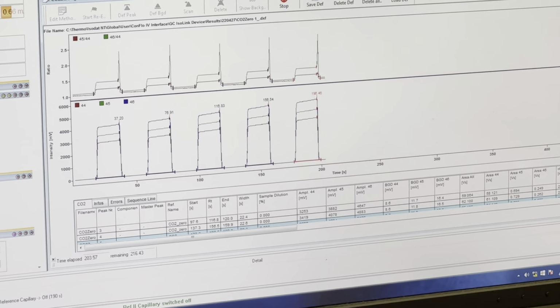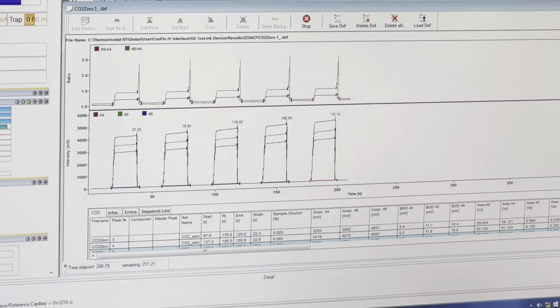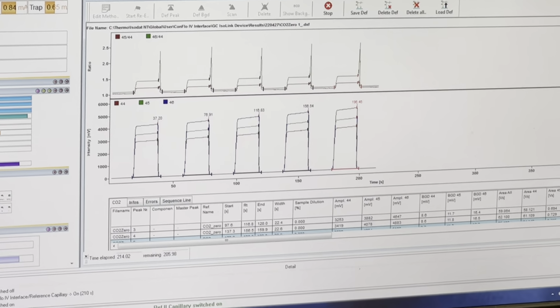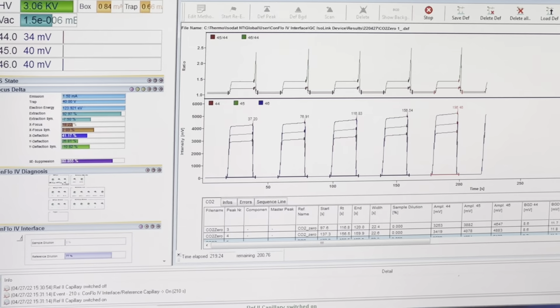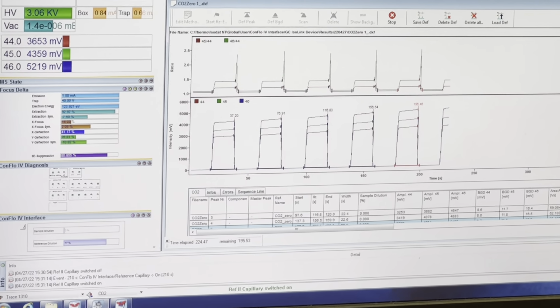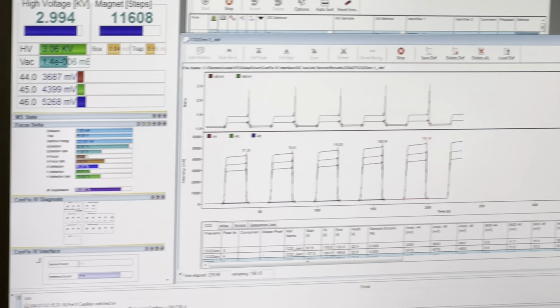Sorry, so when you say on-offs, what are you talking about? These are on-offs. They're also called zero enrichment tests or just zeros. There's several names for them. It all means the same thing. What this is doing is inside the conflow, the CO2 is always flowing, consistent flow. It's just that the capillary is going up towards the sniffer for 20 seconds and then back down, and then up and then back down.